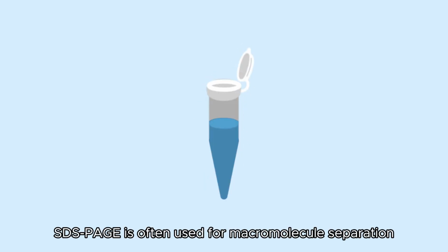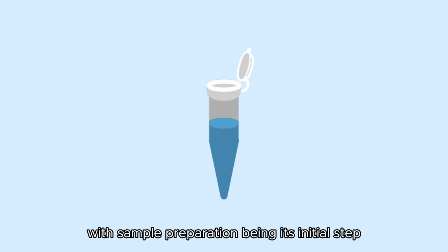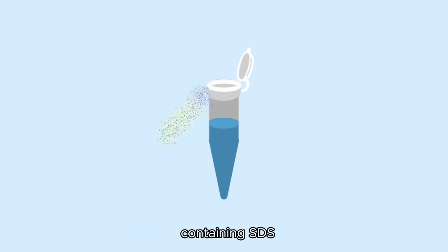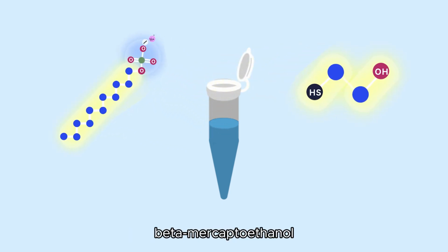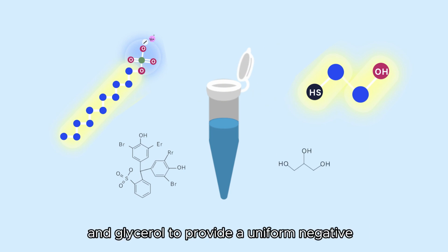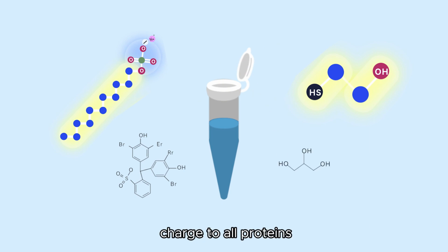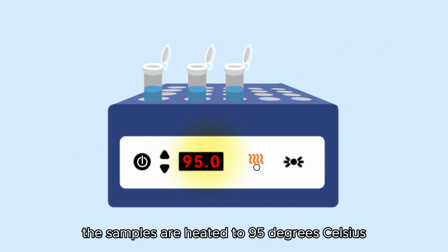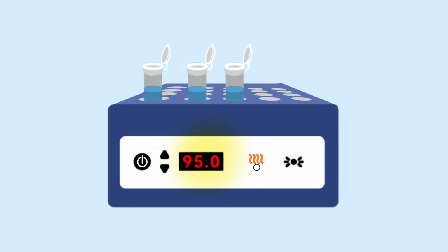SDS-PAGE is often used for macromolecule separation, with sample preparation being its initial step. Therefore, protein samples are treated with a loading buffer containing SDS, beta-mercaptoethanol, bromophenol blue, and glycerol to provide a uniform negative charge to all proteins. After adding the loading buffer, the samples are heated to 95 degrees Celsius.